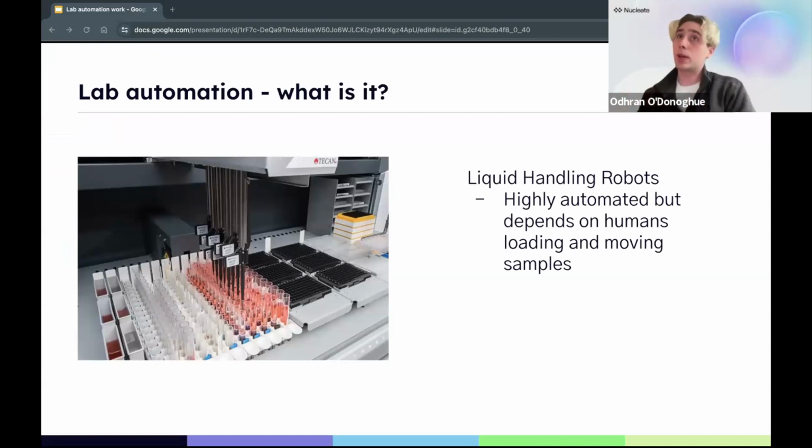Anyways, let's keep going. Lab automation, what is it? Hope you can hear me clearly now. We've had lab automation arguably since the 80s. People have got liquid handling robots moving liquids around. This works great for things like high throughput screening. If you want to screen a substance against like 2,000 little drugs, you can do this. Pharma's been doing it for years. There's no real issue with it.